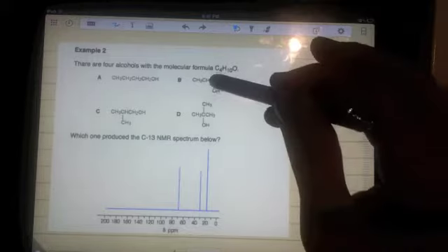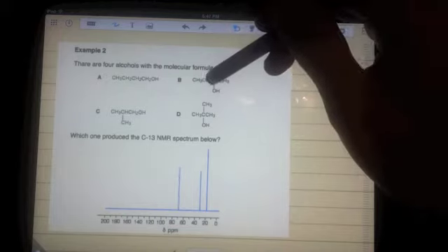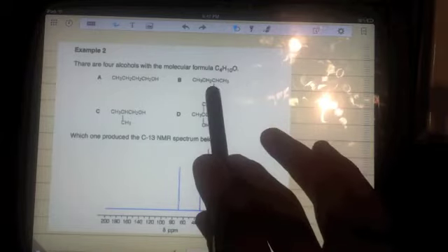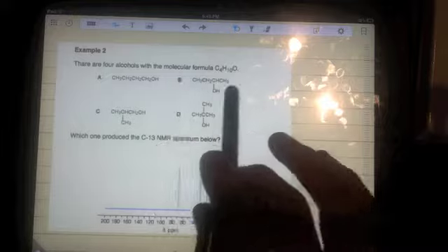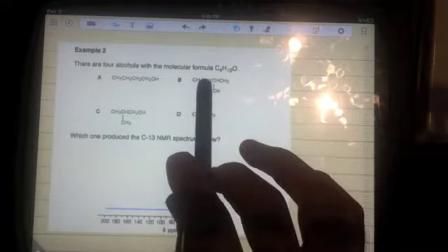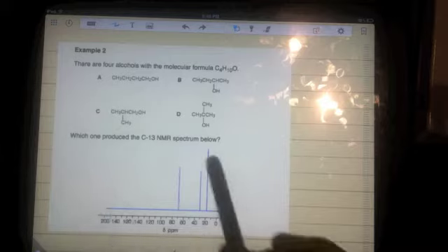Moving on to this one here. All right. Again, we have 1, 2, 3, 4 carbons in a chain. Now this carbon is very close to this one here. This carbon's one off it. This carbon's one off it, so it looks like it's going to be similar, but he has one attached to this guy here. So there's no symmetry in this one either. Because there's no symmetry here, what you're going to see is, again, 4 different bands on this spectrum.